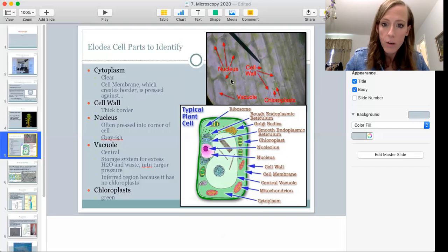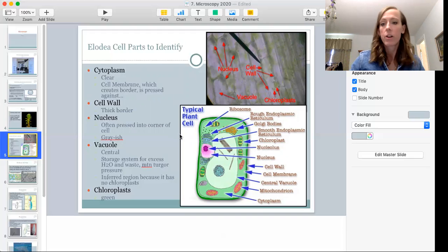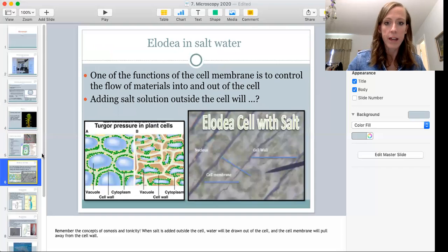Okay. Anything around that then that does not look like a nucleus, those are going to be lots of small chloroplasts, which you can actually observe traveling around the outsides of our Elodea cells. Okay, they're of course green, which make them readily observable and apart from the vacuole. Okay, all right, so let's move on to our next slide.